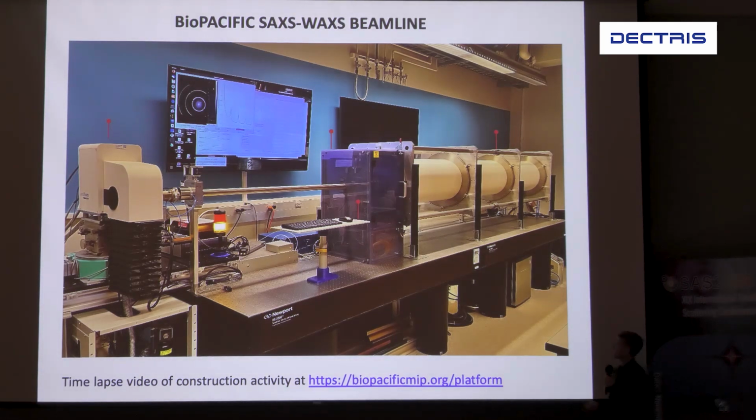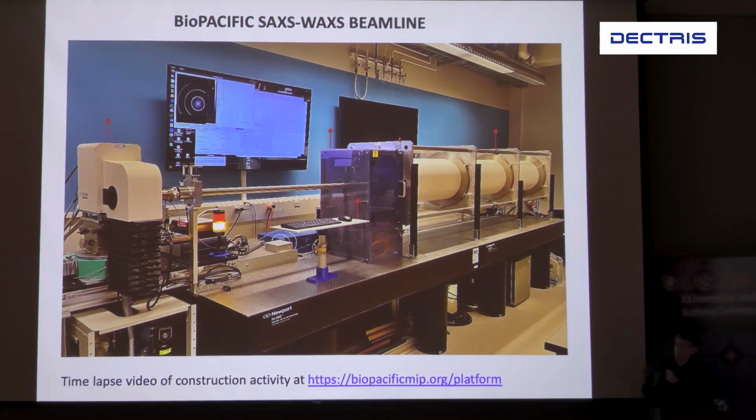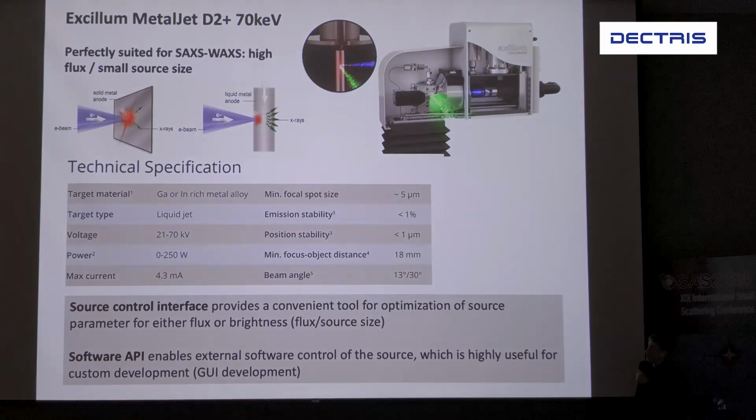So here is what it looks like after it was completed. You can see that unlike most systems, the detector is in vacuum, however the sample itself is completely open. It allows us to accommodate much larger samples and more specific samples. So unlike industry where you have a certain type of sample and you need to run it many, many times, we have multiple different types of samples that only need to be run once or twice, so we try to be more modular.